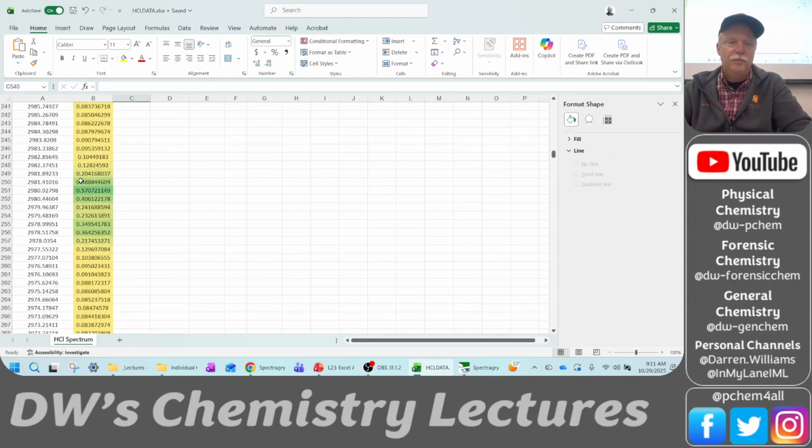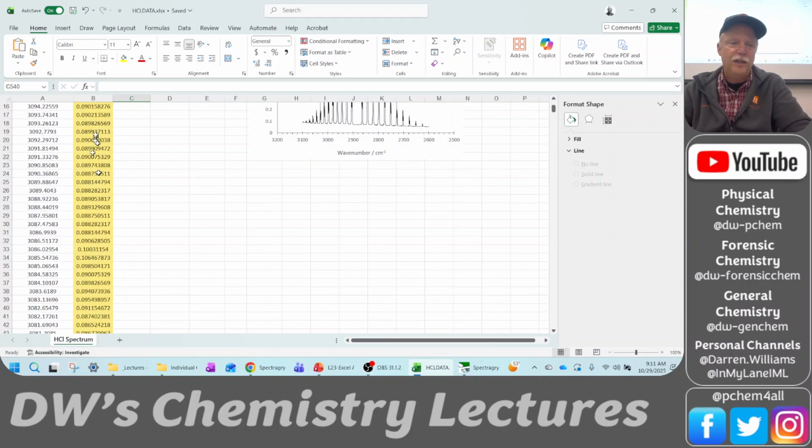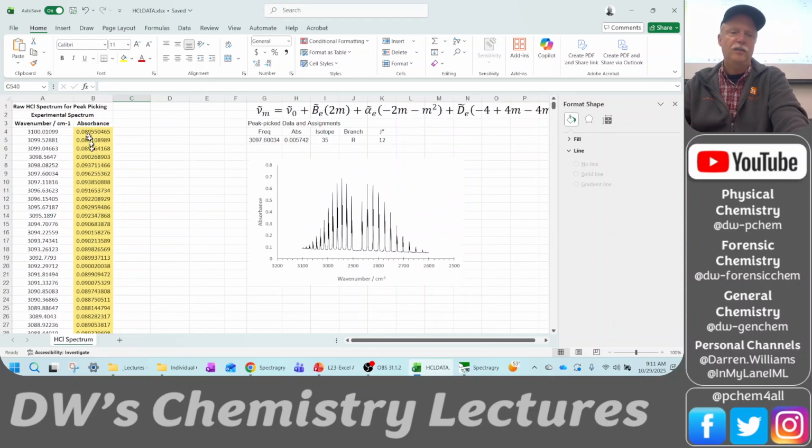The problem with doing the whole range is when you get down to these smaller peaks, there may be peaks here, but the green is used for the really tall ones, and there aren't enough color increments to color this weak area where there may be peaks. So what we want to do is not select the whole area for conditional formatting. We want to do it a panel at a time.